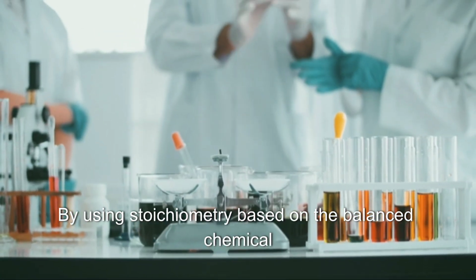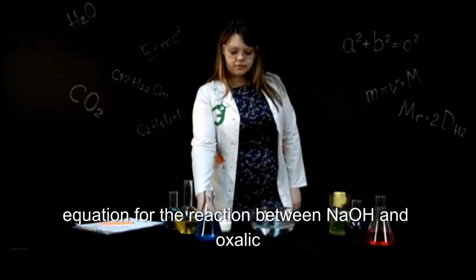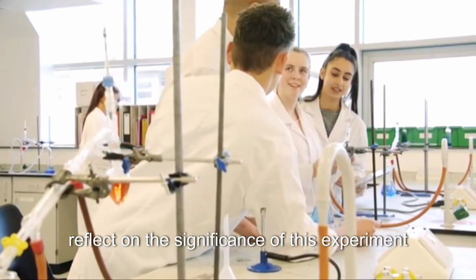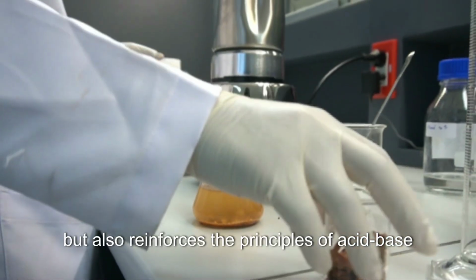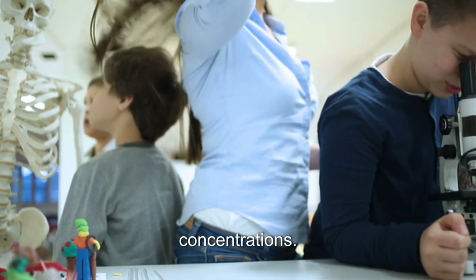By using stoichiometry based on the balanced chemical equation for the reaction between NaOH and oxalic acid, the concentration can be derived accurately. Finally, reflect on the significance of this experiment, as it not only provides valuable lab experience but also reinforces the principles of acid-base titration, further deepening your understanding of solution concentrations.